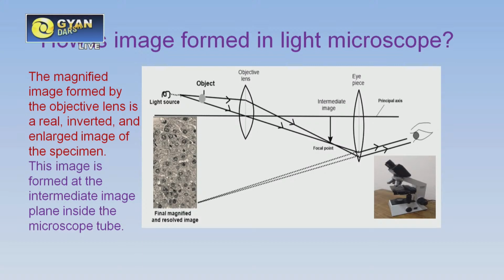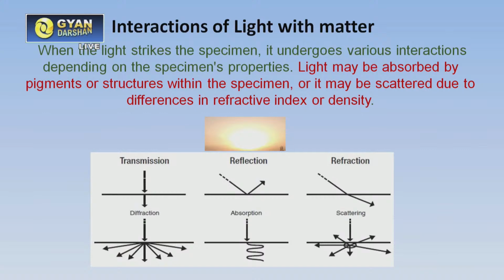So this is the object and the objective lens, and when light interacts with the object, it further enters into the objective lens and the eyepiece. The interaction between the objective lens and the eyepiece forms the magnified image in a larger view. The final image is inverted, meaning it is not the right view of the specimen, but an inverted, magnified view of the biological specimen.